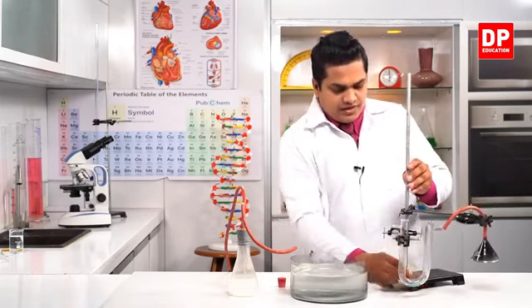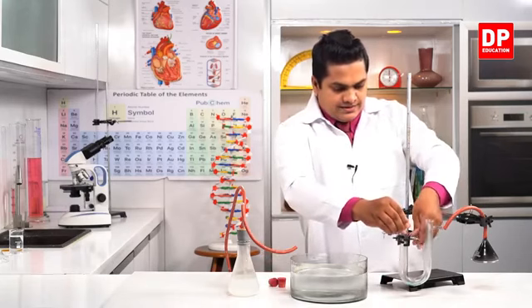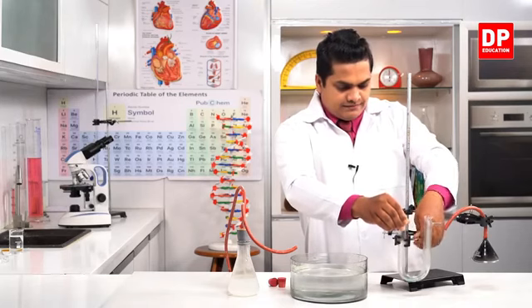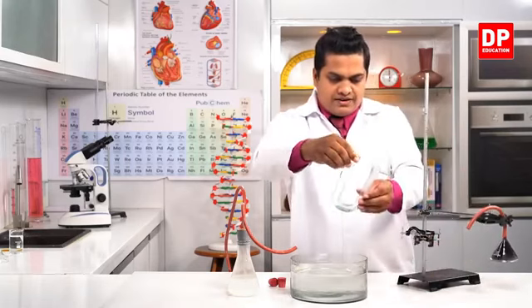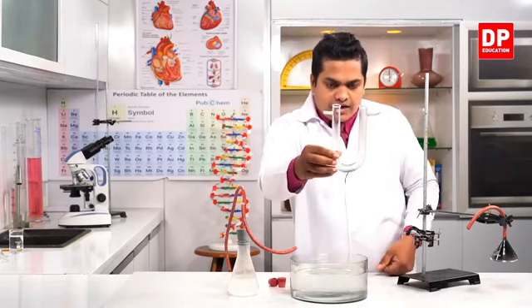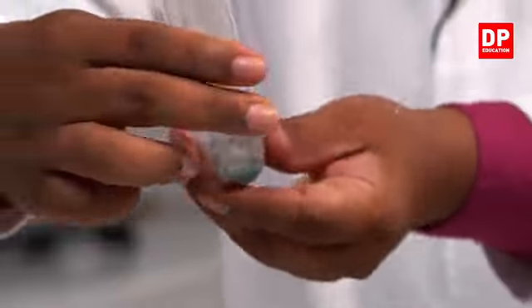Okay then. So here you can observe the color of copper sulfate in here right now. See, the color of copper sulfate solution has converted into a blue color, right?